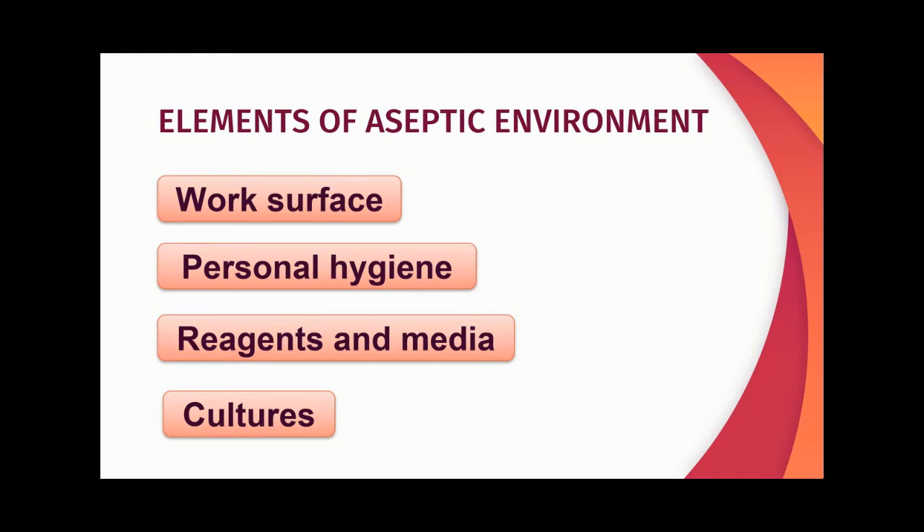Let us see the elements of an aseptic environment. They are: work surface, personal hygiene, reagents and media, and cultures.